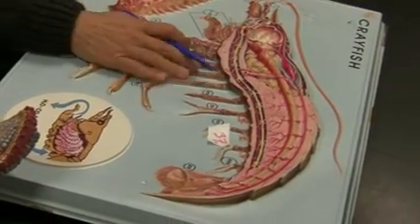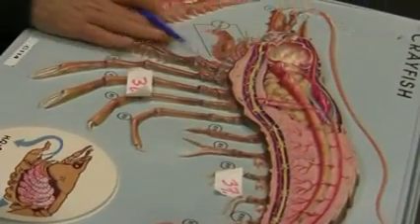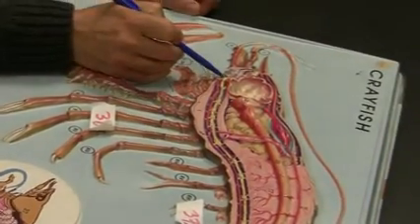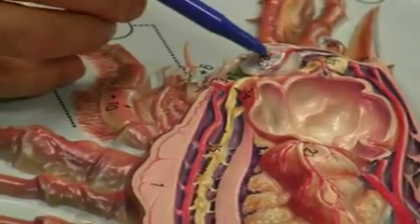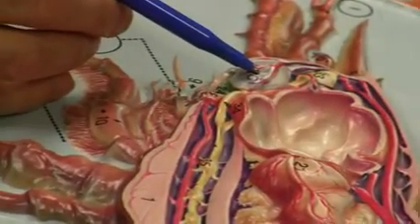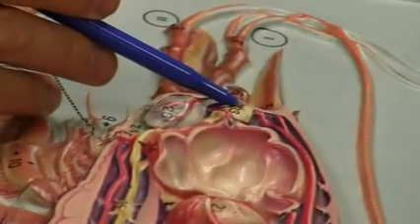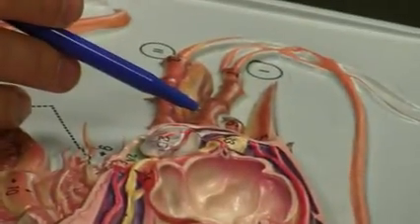I will not ask about that. Branch. Walking legs, chela, chelipeds. Green gland right here. Statolith, for balance, at the base of the antenna. Brain. What else? Did they go over everything?